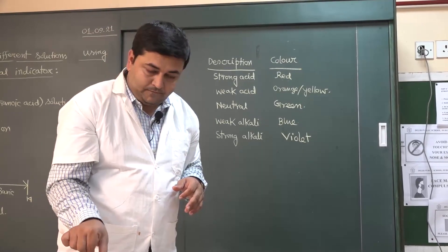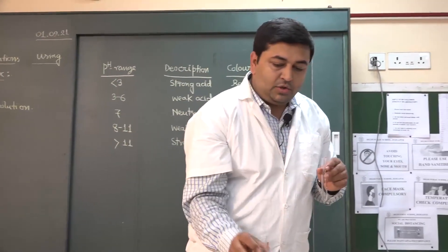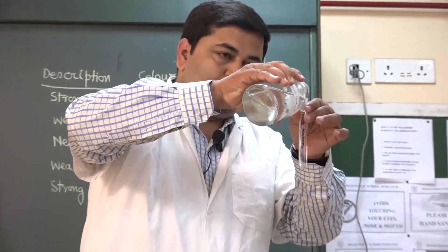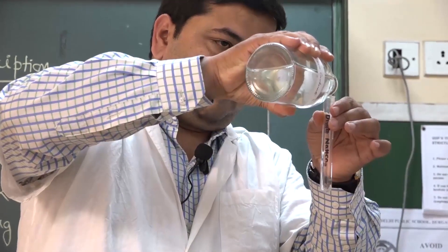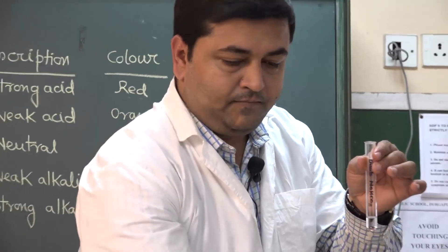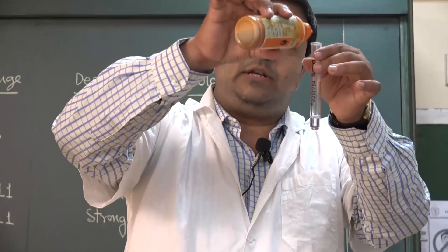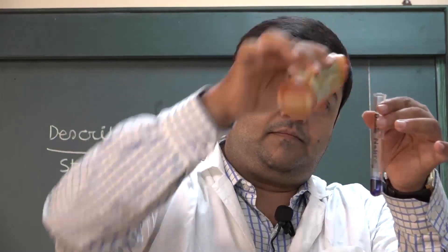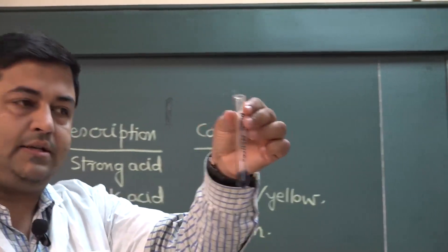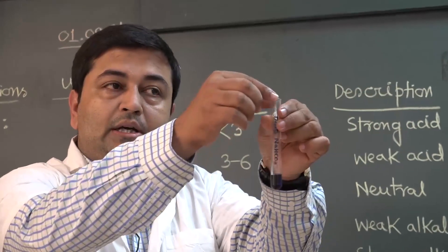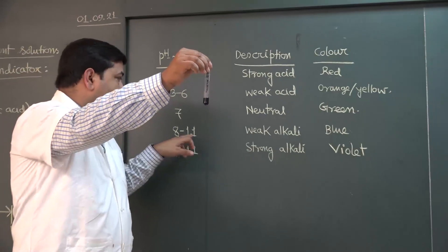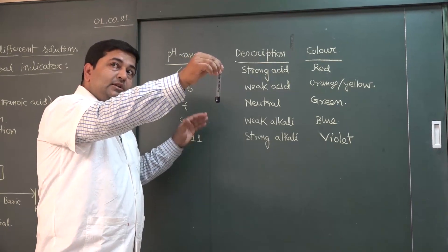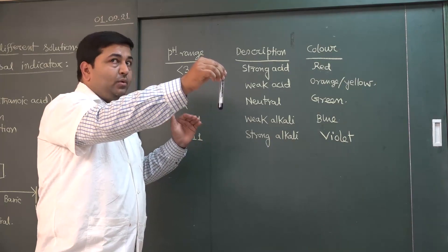Next I am collecting sodium carbonate solution and adding the universal indicator. The color is blue. When the color is blue it means it is a weak alkali with a pH range from 8 to 11. So both sodium hydroxide and sodium carbonate are above pH 7 — one is a strong base and one is a weak base.